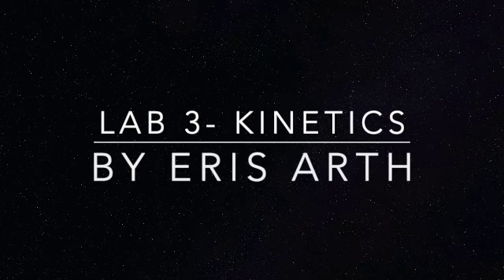Hello and welcome to Experiment 3, which is our Kinetics lab, and I'm going to be going over the pre-lab before we get into this experiment. So the purpose for this lab is to investigate the variables to see how they affect the reaction rate. And going into properties and safety for the compounds oxalic acid, potassium permanganate, and water.